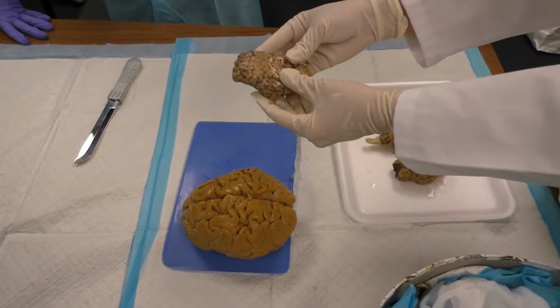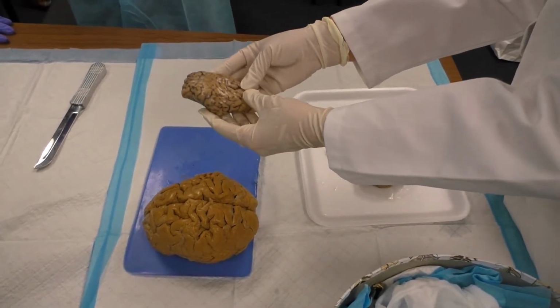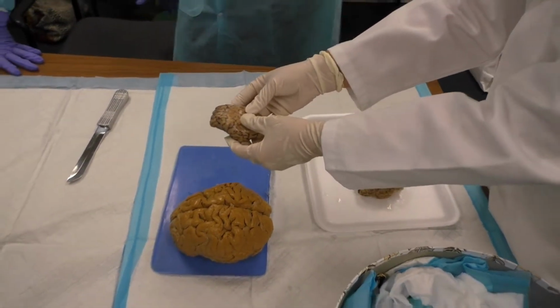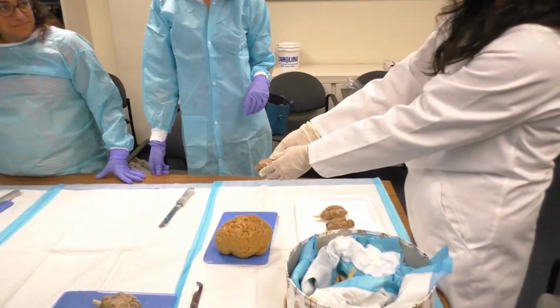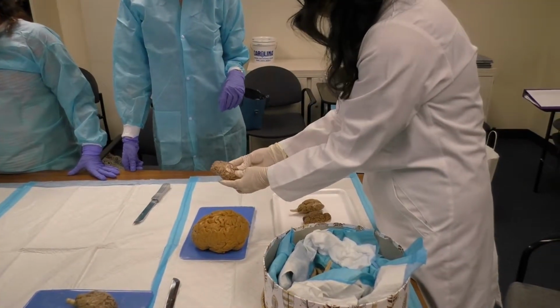And that actually means that the sheep might have a surprising amount of computing power. What do you think those sheep think about all day? Food. Okay. Survival. Anything else? Mating. But is that different from other animals? Oh gosh, I'm getting a whiff of formaldehyde.